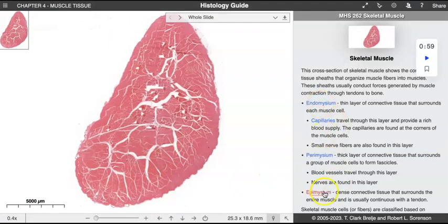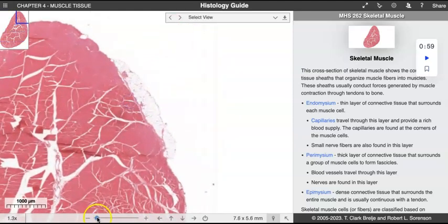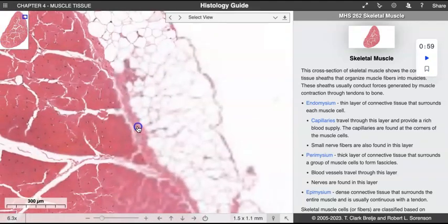And, oh, they do. They have them right over here. Perfect. So this is an entire muscle group. And at the periphery, you can already start to see some of that fibrous nature, and that is going to be your epimysium. So even if we were to click over here, let's see. Oh, you can actually see a little bit of fat there too.